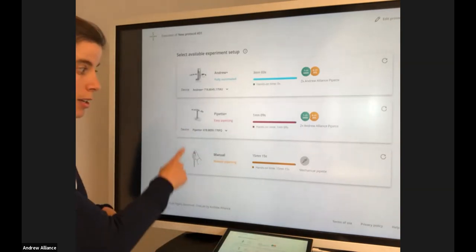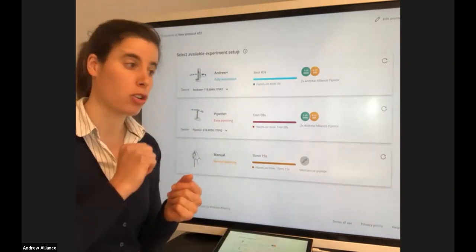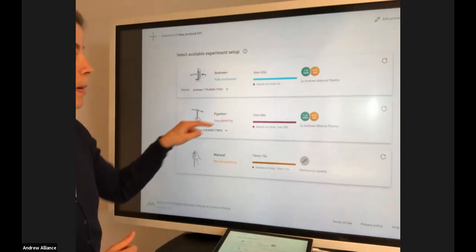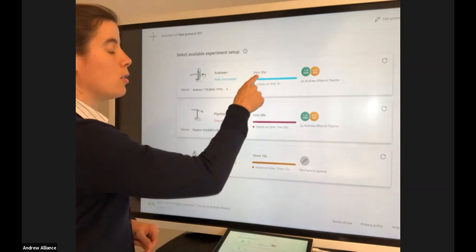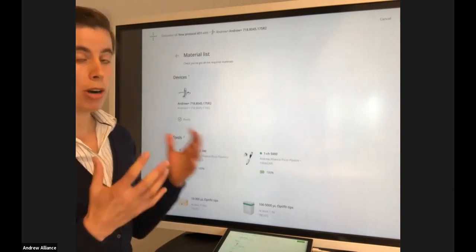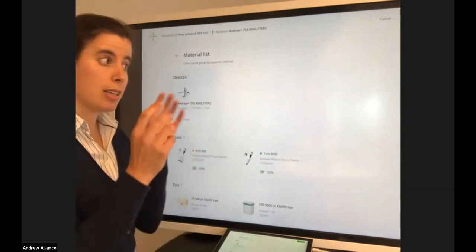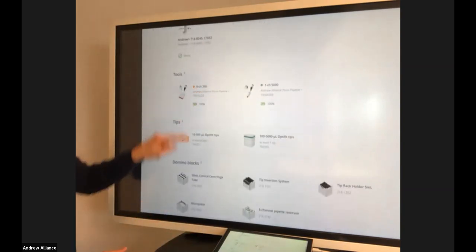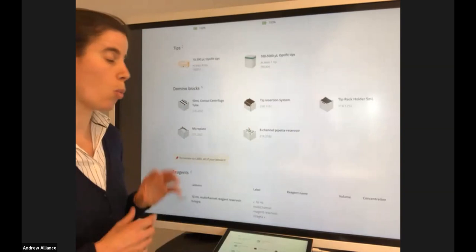One of them is to do it manually. So really with, for example, a single channel pipette, well by well, where you as a user have to change the volume. You really have to do everything manually. The other ones are the Andrew Plus robots and the Pipette Plus smart stand. We'll do both today. So I'll start by saying I would like to run this protocol with Andrew Plus first. Very important here is, remember I didn't mention in the designing of my protocol to use a multi-channel. I didn't mention which tips I wanted to use. This is all done in OneLab, and here you see exactly the type of pipettes, tips, and domino blocks I'll need. I'll talk about the dominoes later when Andrew Plus is actually working, so you have an idea.